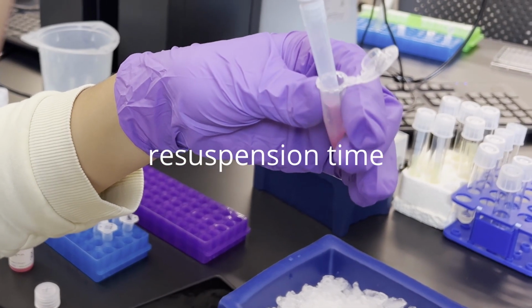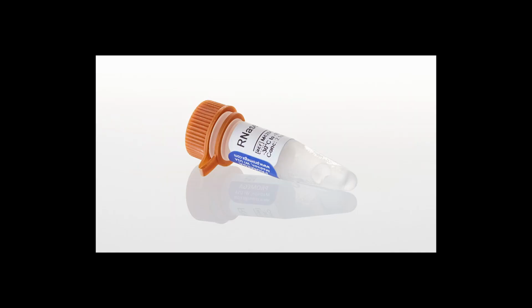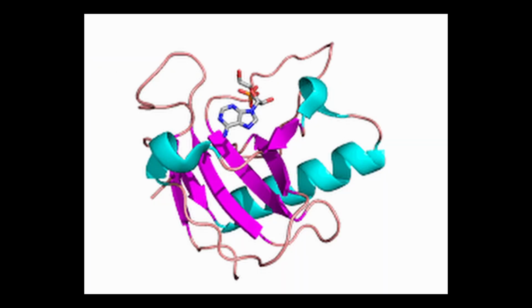Now, we will take our pelleted cells, discard the culture medium, and resuspend in the resuspension buffer. This might include RNase A, so make sure this buffer is kept at 4C, since RNase A is an enzyme. If the enzyme becomes inactivated due to improper storage, the RNA won't be removed.